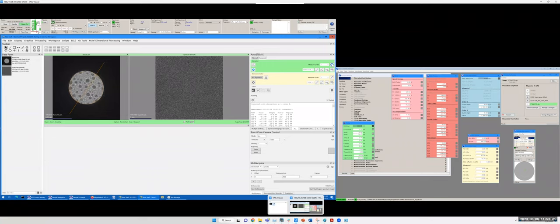Because I changed the field of view from 1000 nanometers to 16,000 nanometers. You can see you have a little bit of coma, C21b, right? That is the effect I was telling you about. If you change the field of view from very large to small, or from small to large, the coma changes. So you want to correct and measure again to make sure that effect is removed.